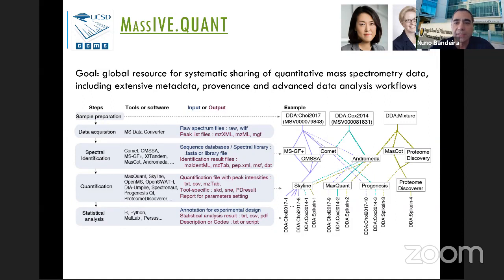There's a lot of different ways in which you can search the data. You can use different search tools, you can use different quant tools, and you can have different types of mass spectrometry experiments. All of these things require different configurations on how you run the software and how you use it. So it's very useful to have a place where you can deposit all the details of these analyses in a manner such that you can go back and reproduce those searches yourself, because that is the first step, or one of the very important steps, in then being able to do it again for your own data going forward.